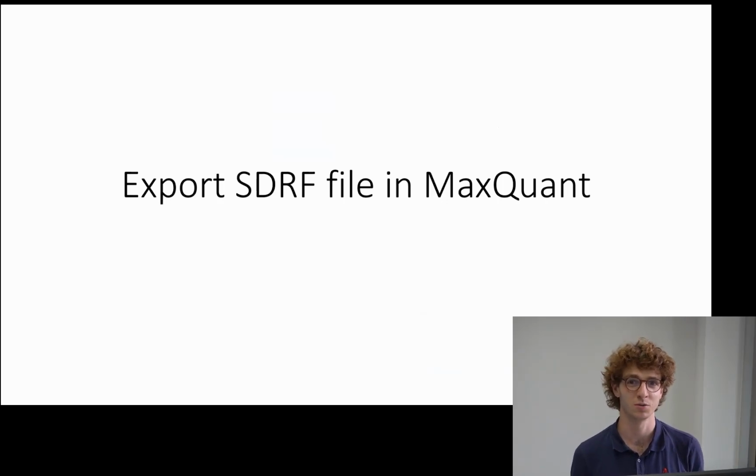Today I want to present to you a new feature in MaxQuant and Perseus where you can annotate the raw data with all kinds of metadata. And the feature is called export SDRF file in MaxQuant.